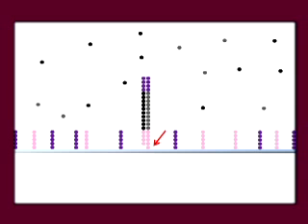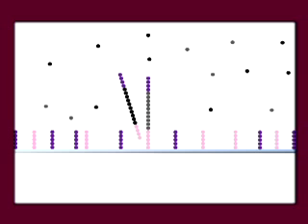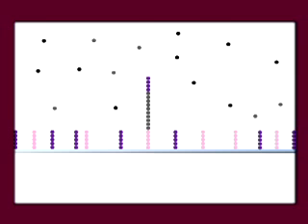Because the copied strand starts with a primer attached to the flow cell, that strand is bound to the surface of the flow cell. Then the temperature can be increased and the original strand is melted off, leaving a single strand bound to the flow cell surface, surrounded by a dense lawn of primers.